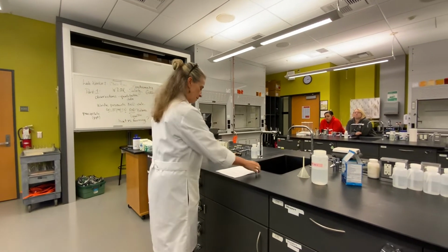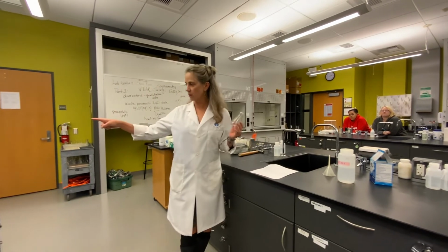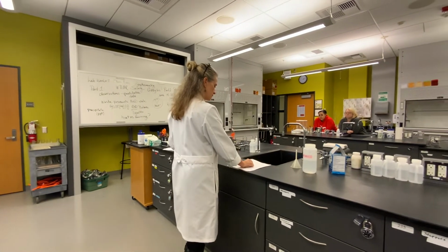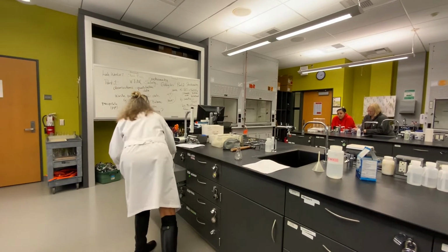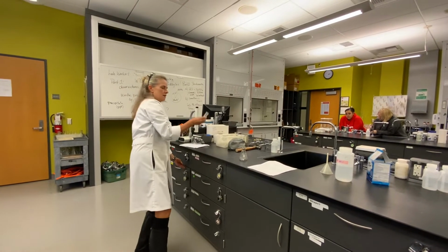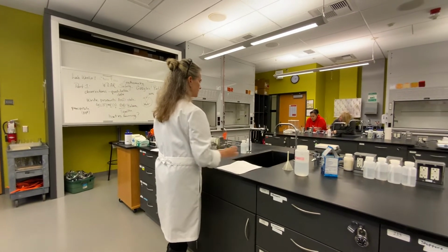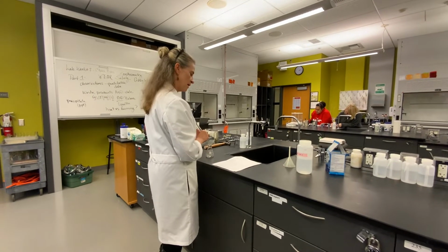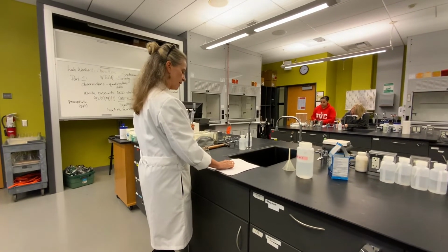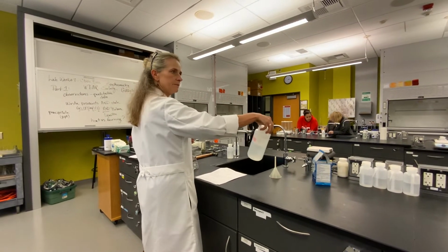So ultimately, we've got the mass of the sodium bicarbonate from the balance. That goes in the first box. You want to take an empty graduated cylinder, okay? You're going to get the mass of that. That goes in the second box. This doesn't have a base to it. Then you're going to take the graduated cylinder and fill it up with 25 mils of hydrochloric acid, okay?